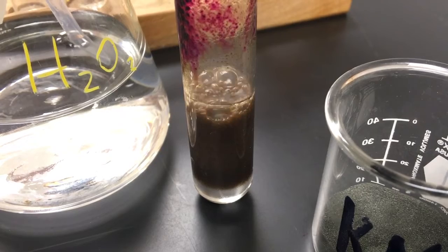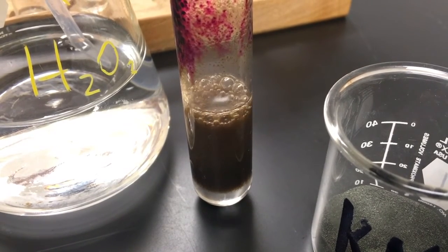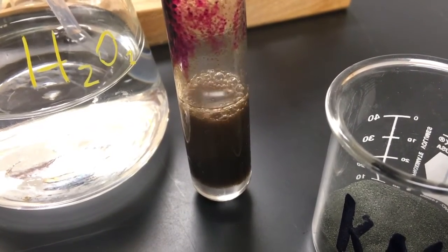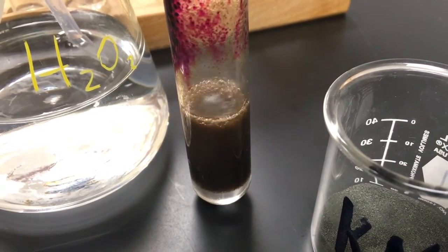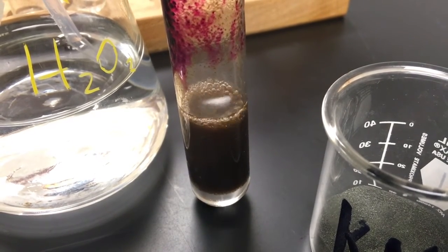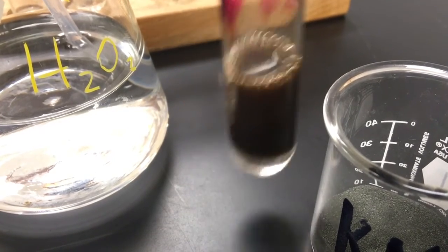Now I do mention in the instructions that this KMnO4 is a catalyst. And I say it's just a catalyst, and I use that phrasing to help remind you that catalysts are kind of the cheerleaders of our reaction. They help get it going, but they are not actually part of the reaction. So we shouldn't be including that KMnO4 anywhere in your balanced chemical equation.